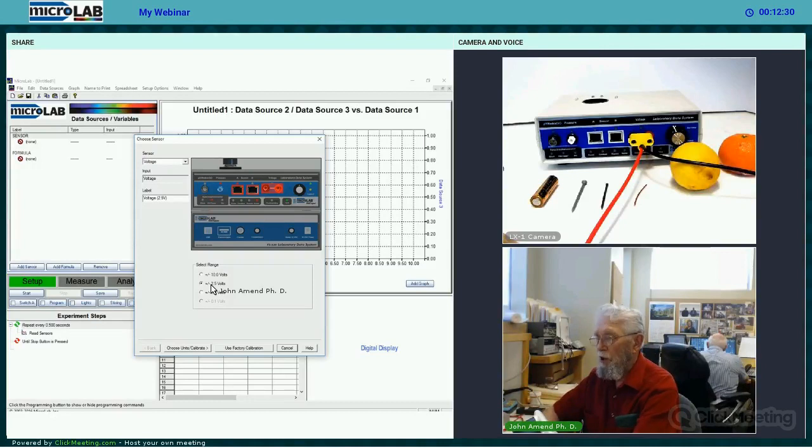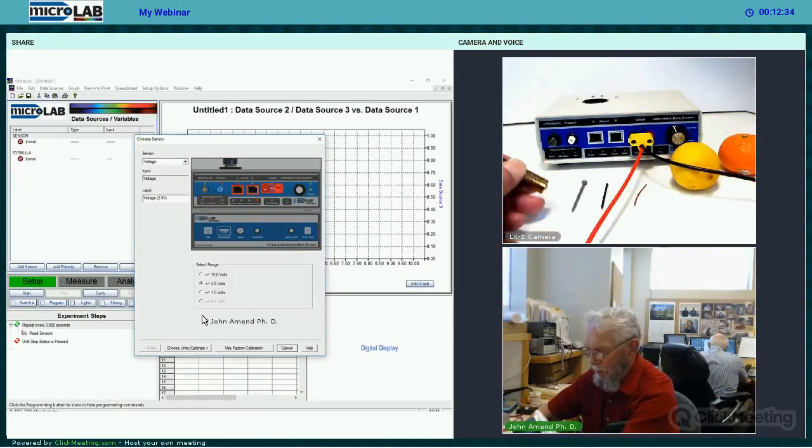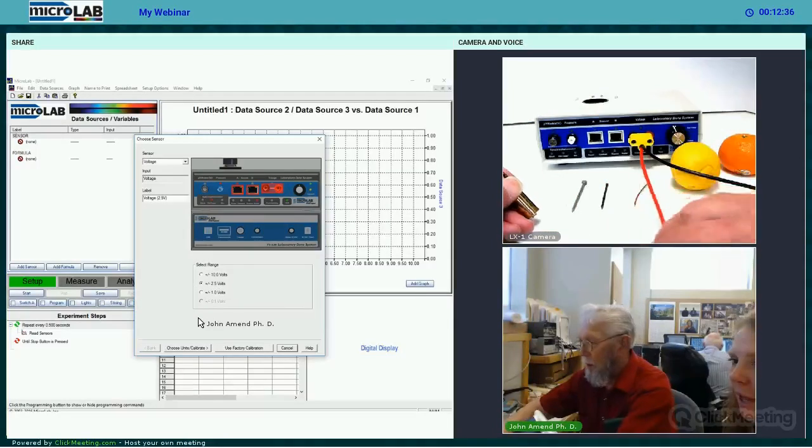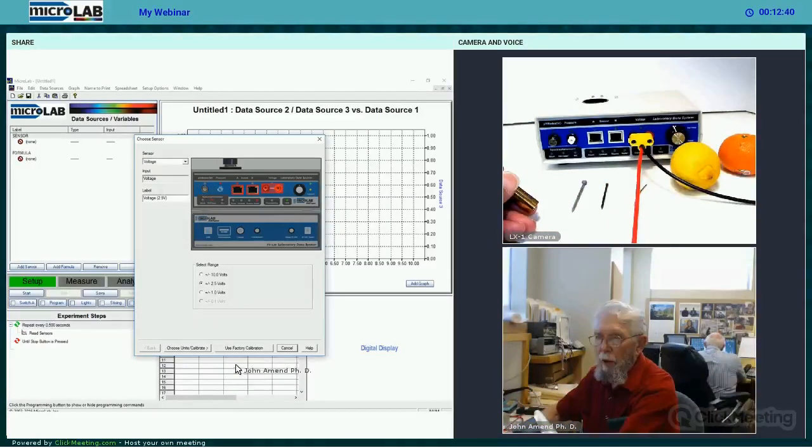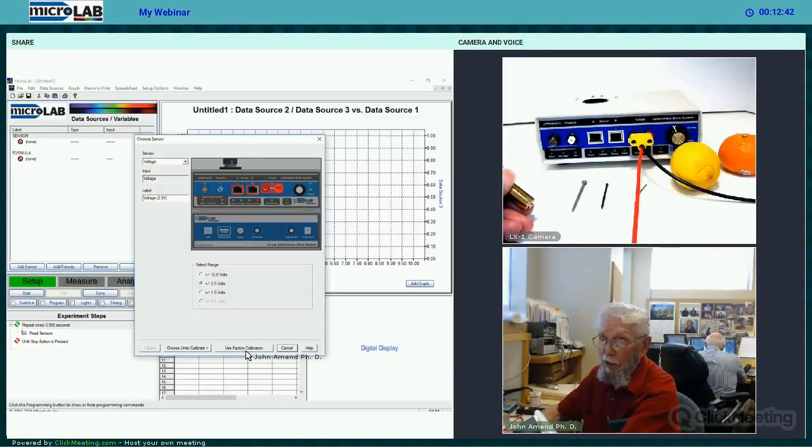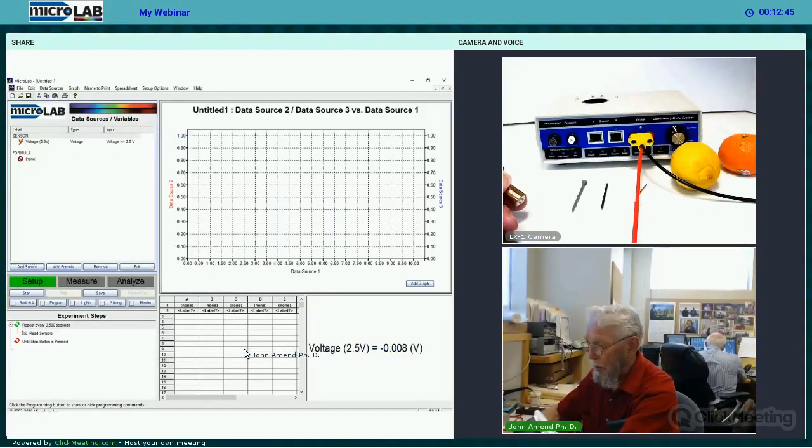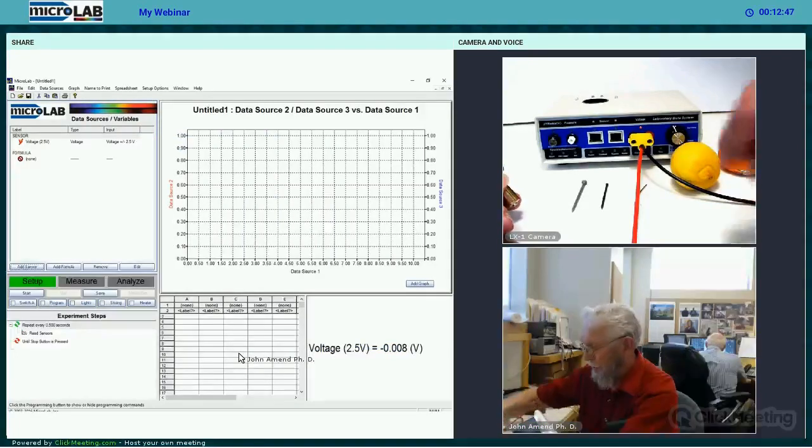So that should be adequate for anything that we happen to be dealing with. With that in mind, let's get a reference point. So we'll take the little battery that we had. And I've just been notified that that's about something, U.S. factory calibration. Yes. And I have it now.